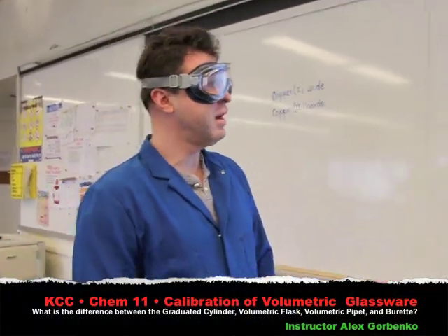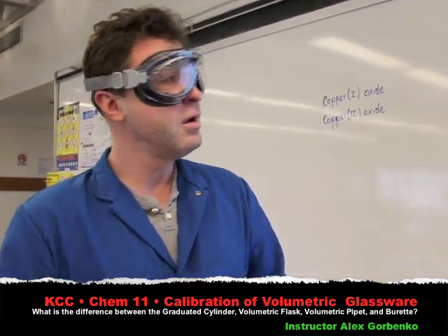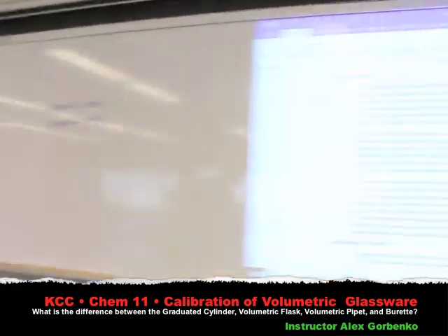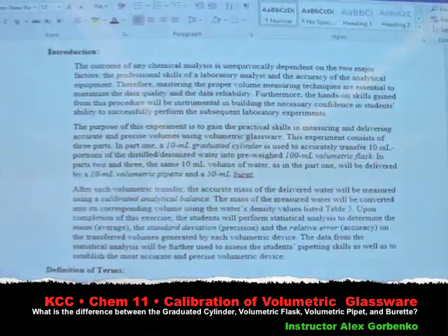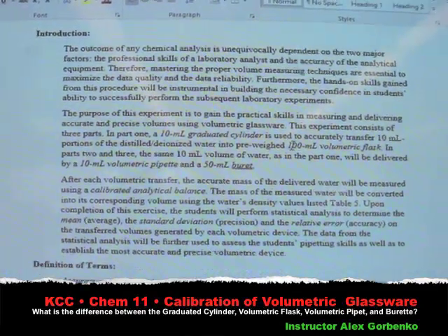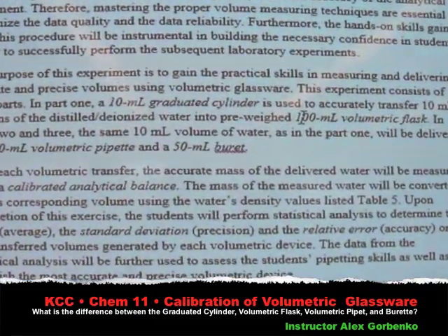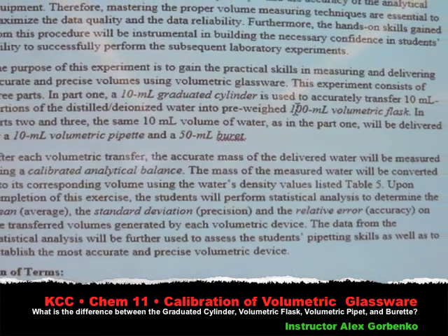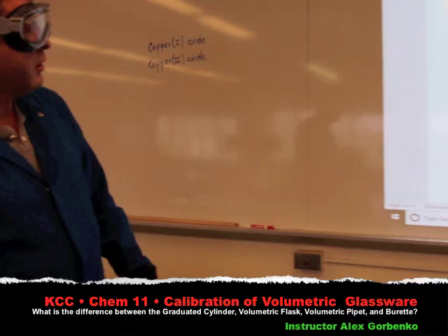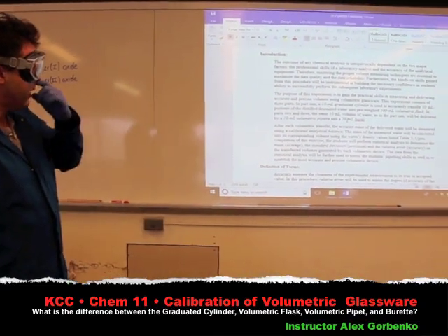Alright guys, today we're going to do a demo on how to use different types of glassware. We're going to have three different glassware as you can see here on the procedure. We're going to be using a 10 ml graduated cylinder, a 100 ml volumetric flask to contain the water, a 10 ml volumetric pipette, and a 50 ml burette.